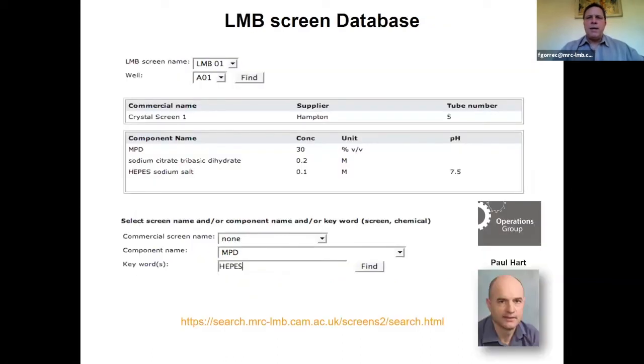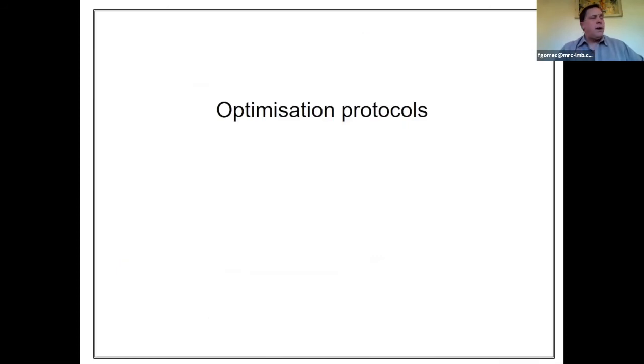Also, to analyze the formulation of all the different hits you may have, we developed a freely available, web-based software interface where you select your hits and you can produce the formulation of different conditions in an Excel file, which can help as well. Time is running out.